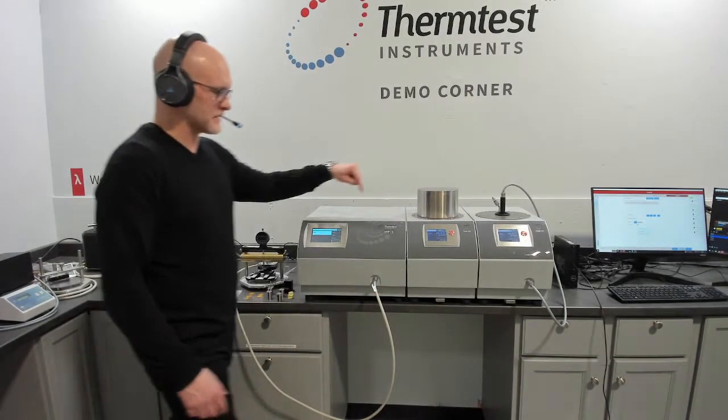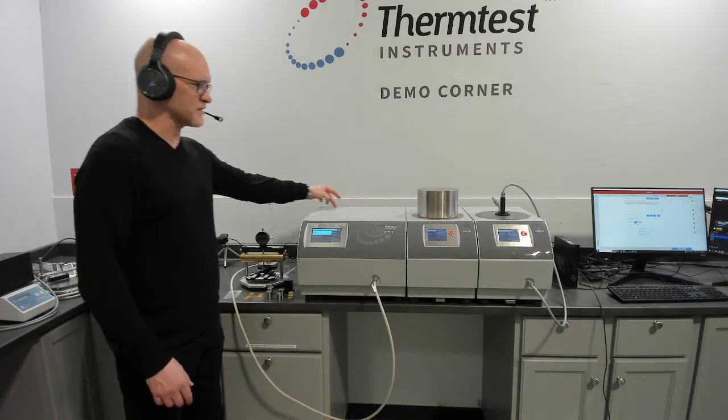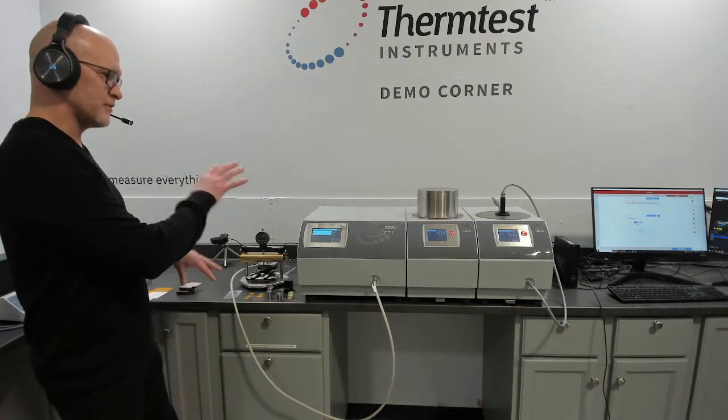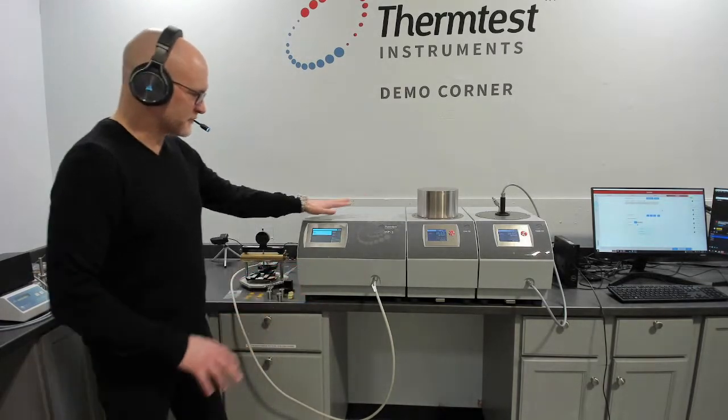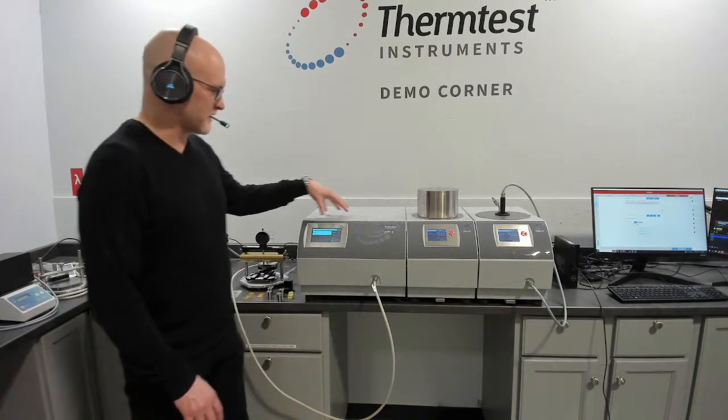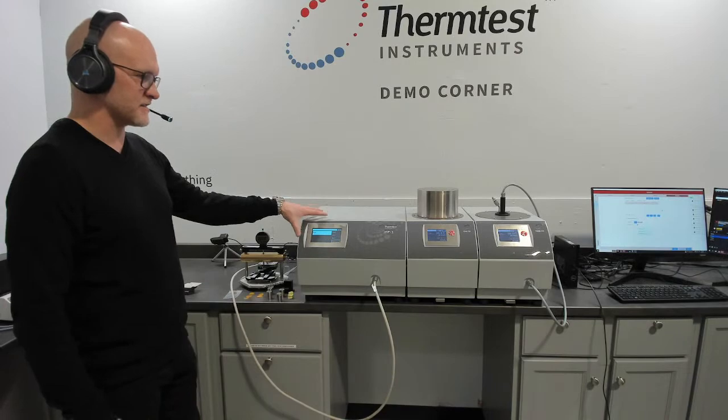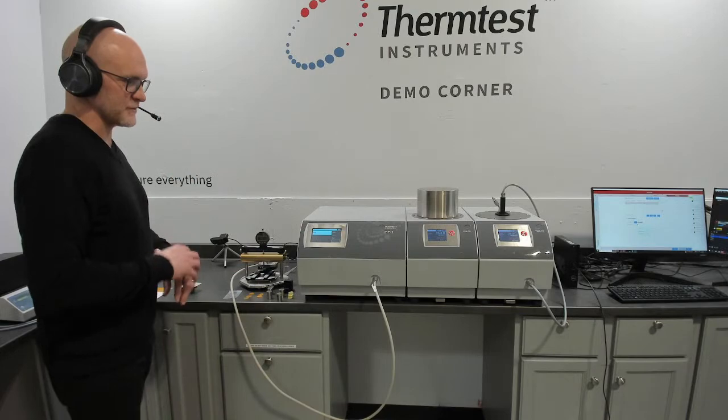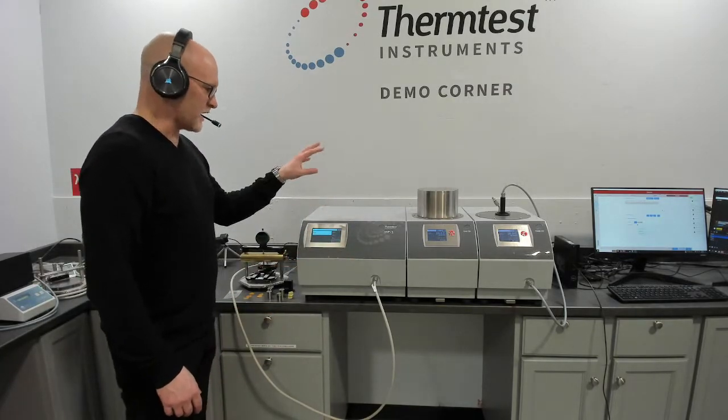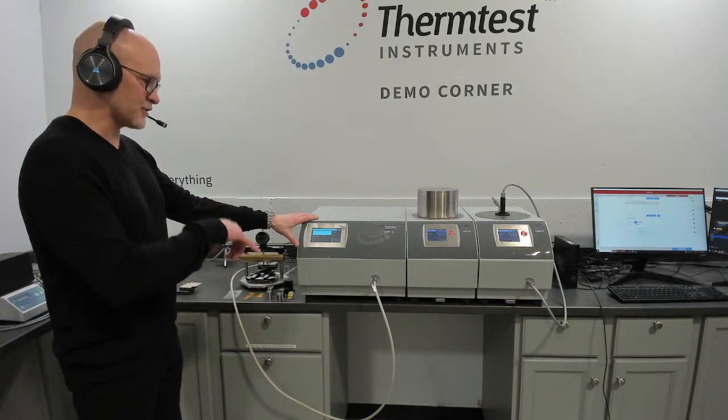The reason why we're able to add these devices to this are the MP1 controller has a built-in four channel switch. So one channel in the front and three channels in the back. We have smart software that allows you to schedule and take advantage of the controller to control multiple sensors of the same method or multiple different sensors in different methods or multiple temperatures. So traditionally, if you have one controller and one temperature device with only one connection, your instrument is locked into the temperature measurement until it's done. By using the MP1 with multi-channel and smart intelligence software, we have the ability to run multiple channels and controlling and getting access to the controller to run other sensors at room temperature or other temperatures to take advantage. So it's essentially like having four controllers side by side, but in one profile and a cost that's significantly less.